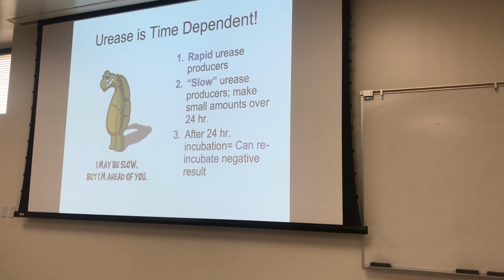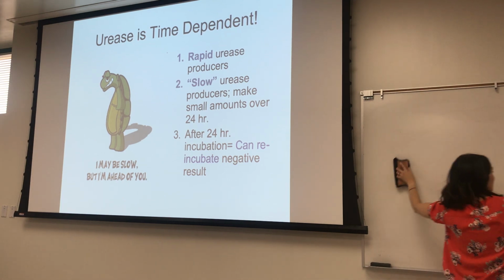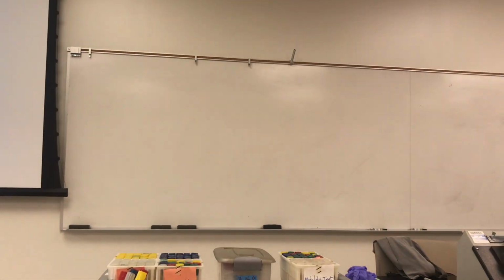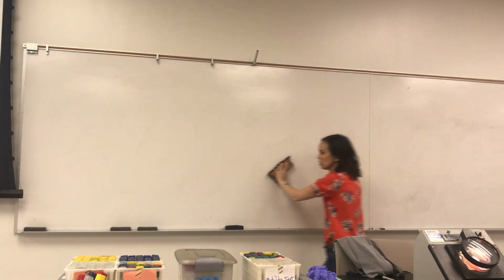If this happens to you on the project though, and you don't feel super confident about reading your result, you can definitely always put it back in the incubator. Just give it a little extra time. Usually that helps a lot because it gives it time to change the color even more, and then generally people don't have any issues with it. So I just wanted to mention that in case that happens to you.